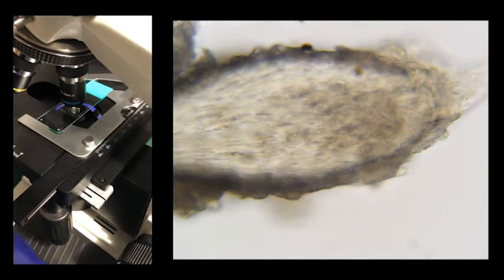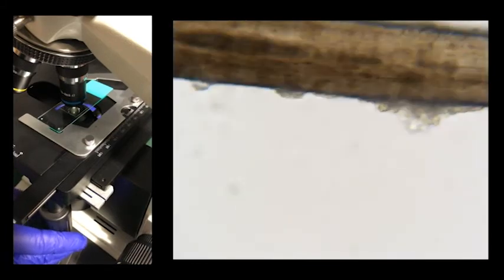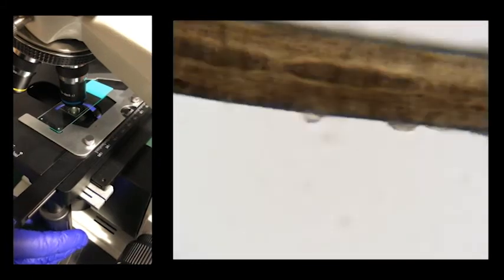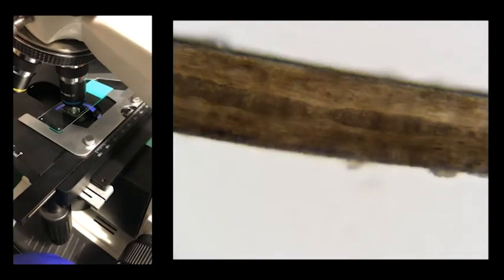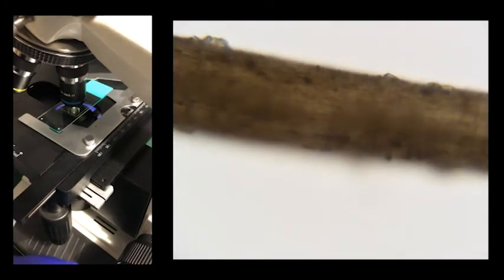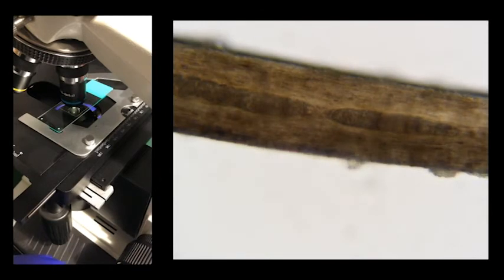So I'm going to move down the hair shaft a little so that you can see some different features. With this close of a magnification, you can see some really neat things. If you play with the fine adjustment knob, you can see that there is a cuticle on the outside of the hair. You can also see that there is a line in the middle called the medulla.